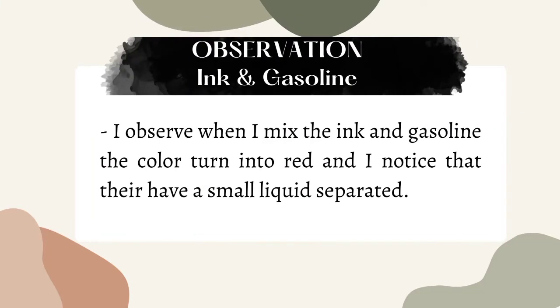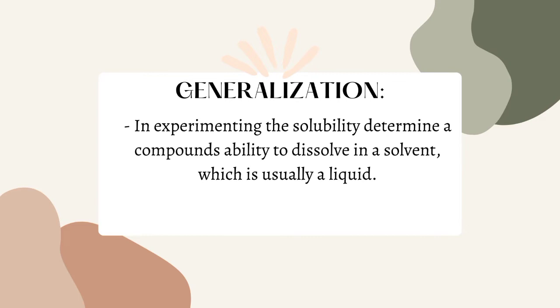Observation of ink and gasoline. I observe when I mix the ink and gasoline, the color turned red, and I noticed that there is a small liquid that separated. Generalization. In experimenting, solubility determines a compound's ability to dissolve in a solvent, which is usually a liquid.